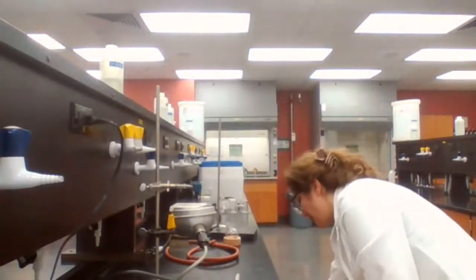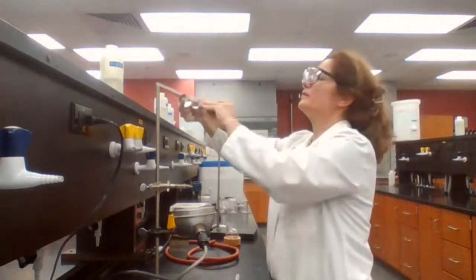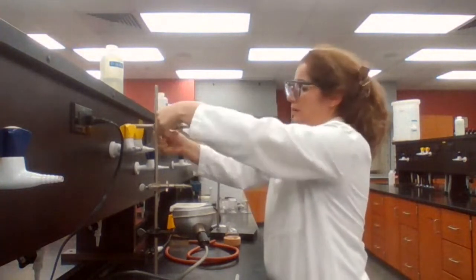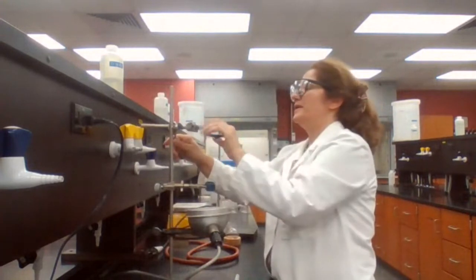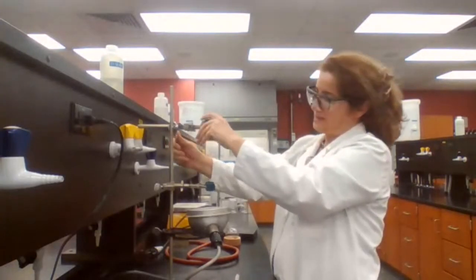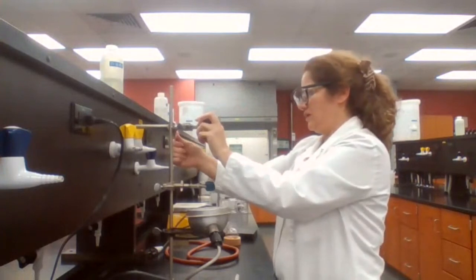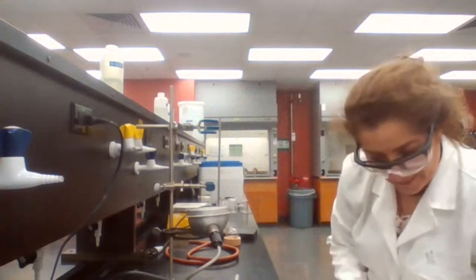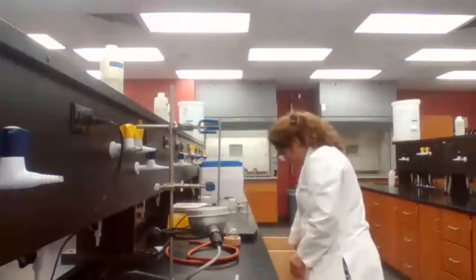Using a three-finger clamp to support the condenser. And the good thing about the three-finger clamp is that we can adjust the arm length and make sure that this stays straight up and at the same level with the utility clamp. Okay, the hardware is ready. Now I'm going to use, if I can find the blue glass right here.